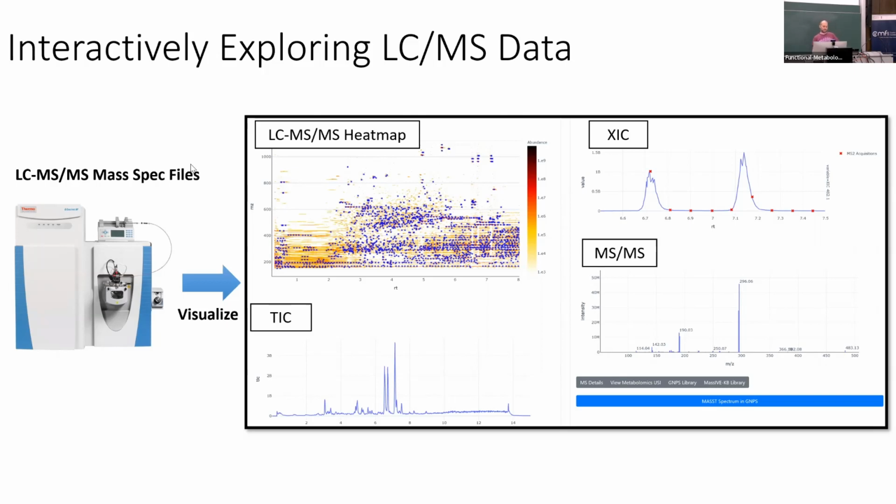So then, looking at this data frame from a different perspective, we would now flip it by 90 degrees. We can look at the total ion chromatogram. There you have intensity on the y-axis and retention time on the x-axis. All the masses are summed together in this total ion current. A few MS analysis tools just provide this by default. Then from there, we can isolate mass traces. In extracted ion chromatograms, you just type in the mass you're interested in and a mass error, and it will directly generate extracted ion chromatograms for you.